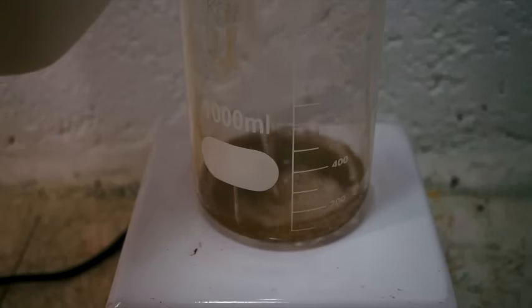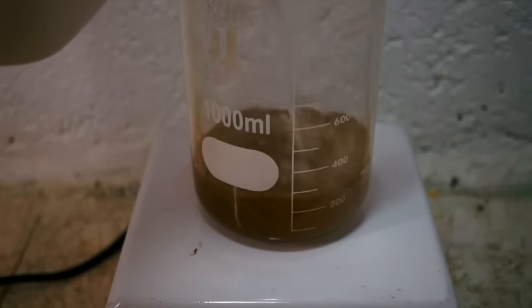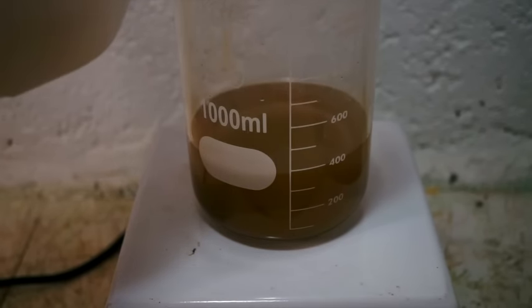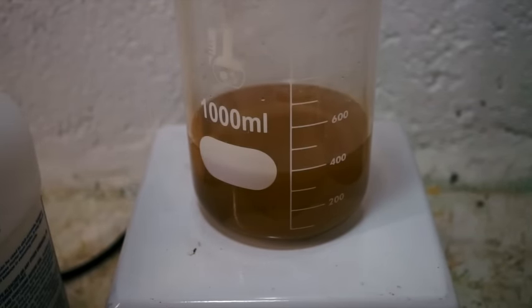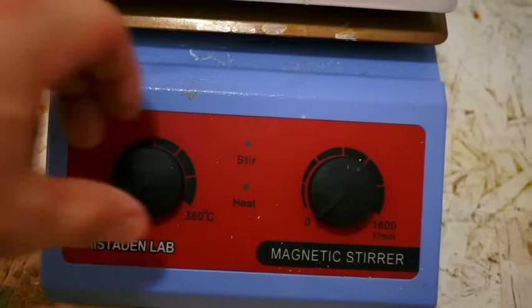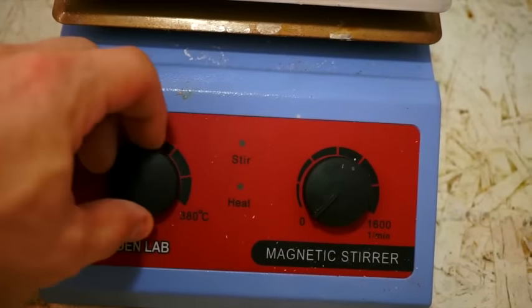Now we will add 400 milliliters of hydrochloric acid. We will then apply a medium heat and strong stirring.